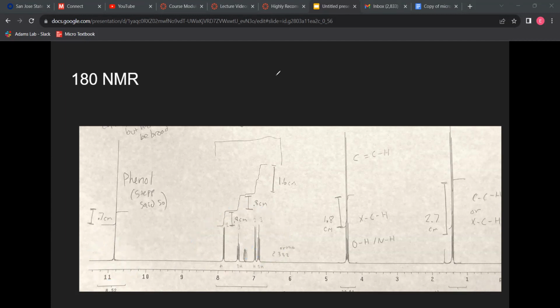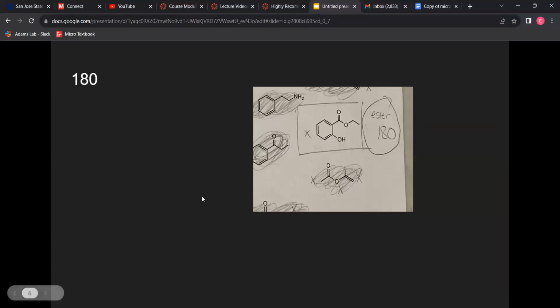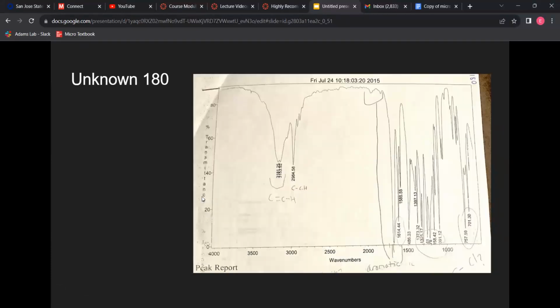So then I went back to here to try and figure out more functional groups. And I noticed that it is very likely that there is an ester on it, as there are plenty of peaks between 900 and 1300, very strong peaks.